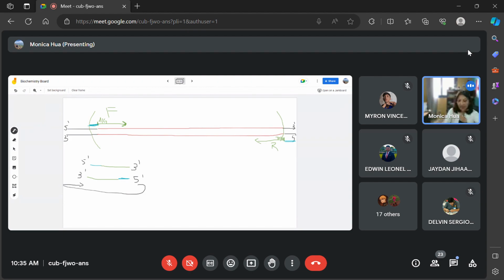So your restriction enzyme site, so let's say I have my ATG here, and let's say this is TAA. If you flip it around, it's going to be 5' to 3'. It's going to have your restriction enzyme site, it's going to have your primer, but this is going to be flipped this way.